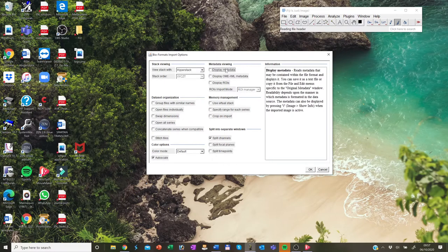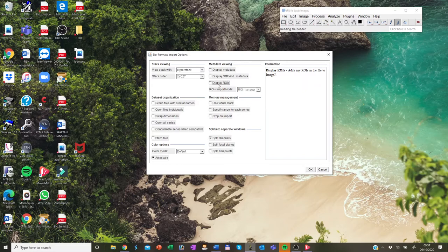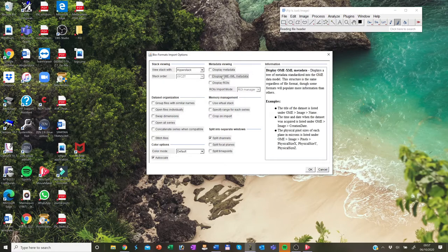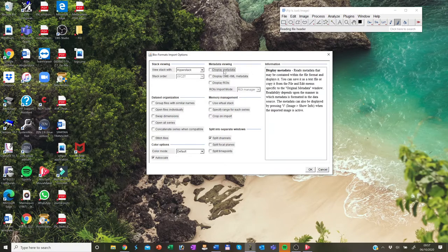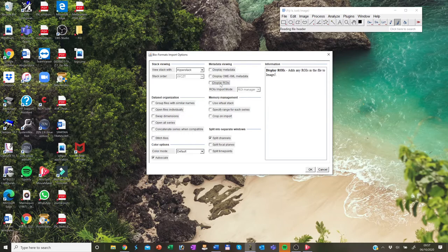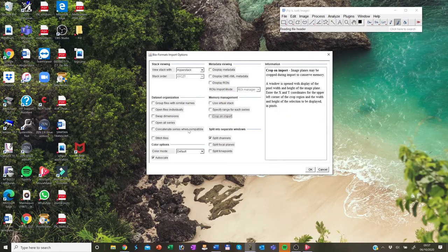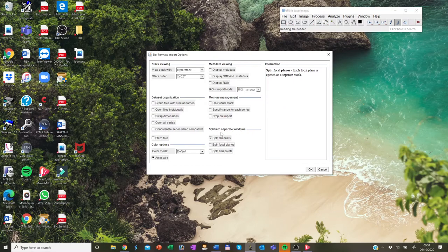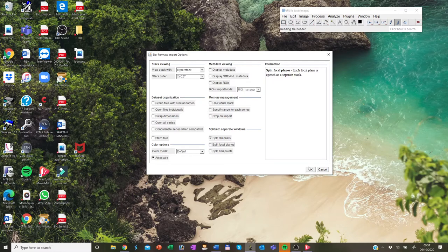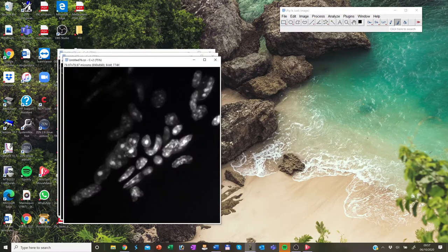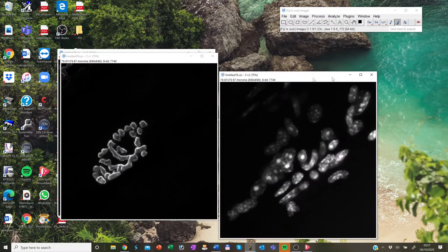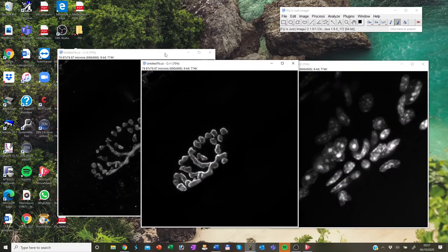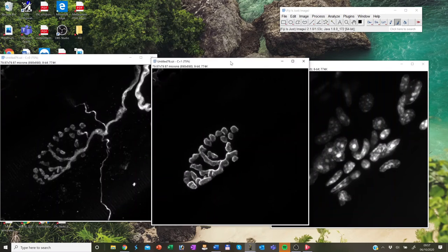And in here you have quite a lot of options how you would like to open up your images. Every time you hover your mouse over a box on the right side in this window, it will give you information and guidance whether you would like to tick that box or not. For example, in here split into separate windows, I click split channels. So I would like to open up my images that all three channels are split in different windows and I click OK and I have all my three channels separated here.